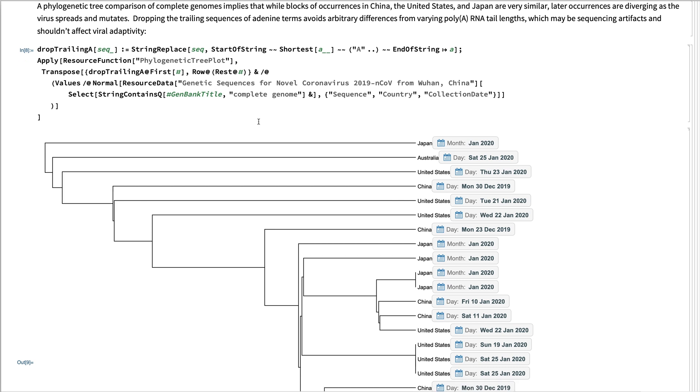And then what we do is we're showing, we're using the resource function, the phylogenetic tree plot.